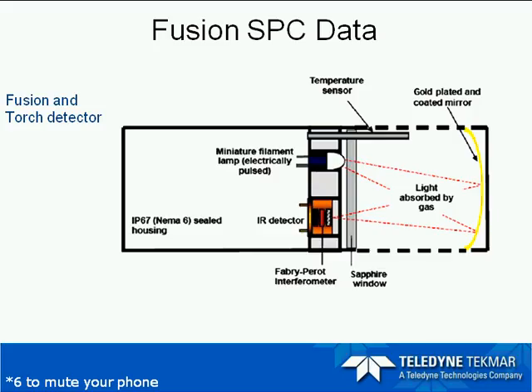It also has a reference wave beam that is non-selective for CO2, and it subtracts out the difference between the two readings. So the wavelength of the FPI changes to the reference band that has no absorption lines. The IR detector experiences full transmission.